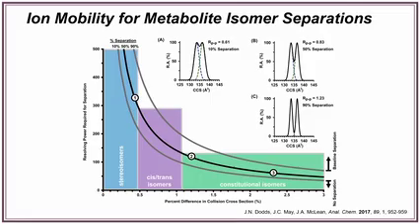If you're trying to achieve baseline, 90% separation, it's going to take a really high-resolution, sophisticated ion mobility instrument to do that. And they do exist now.